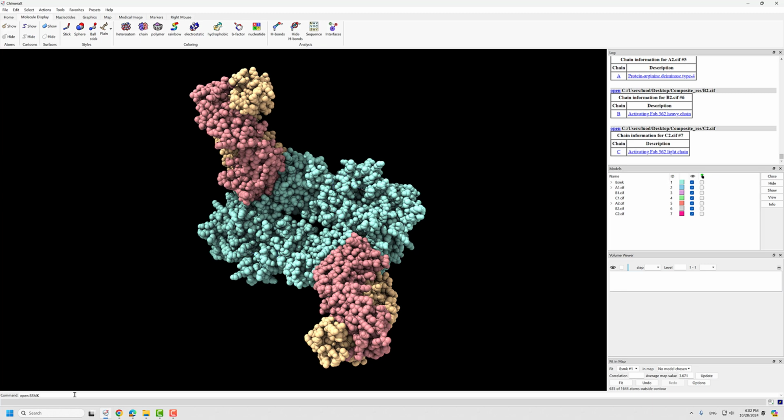So now what we need to do is combine 2, 3, 4, 5, 6, 7. That's gonna be ABC, ABC into model 8 with the name here.